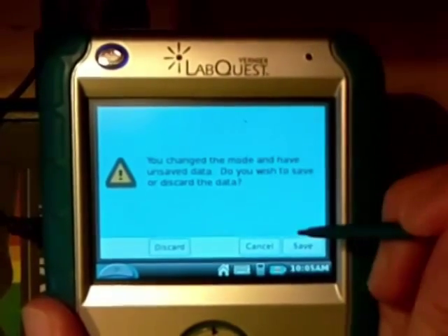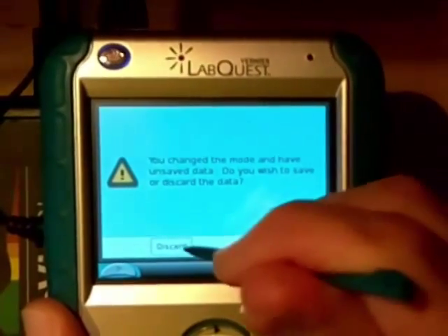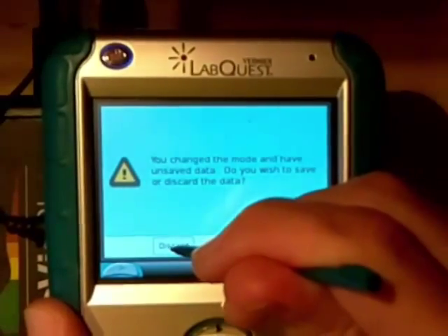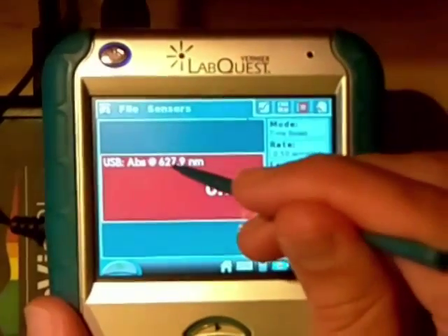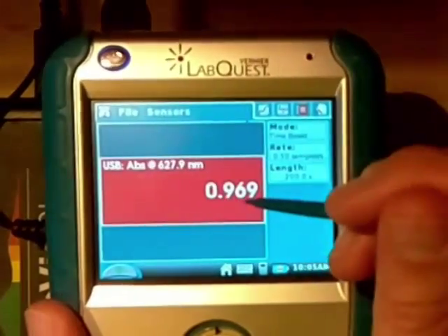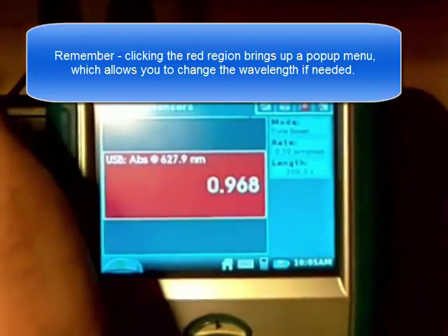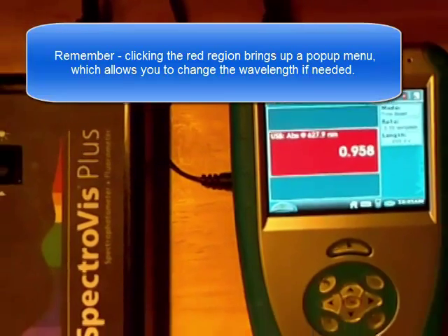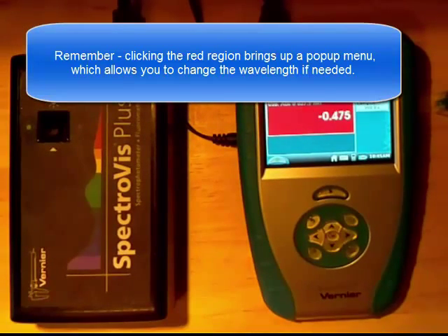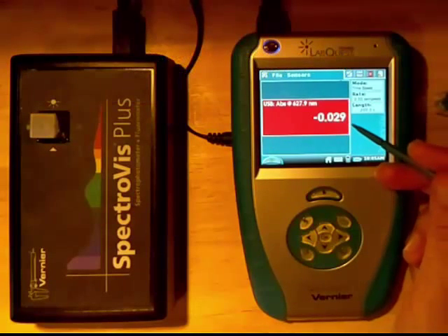Notice how it says we have some unsaved data — I'm going to discard that data since I don't need it, but if you wanted to save it you can. Now notice how it's already selecting the absorbance at the wavelength I had chosen previously. If I take my sample out and put in the colorless sample, we see that the absorbance is pretty close to zero.